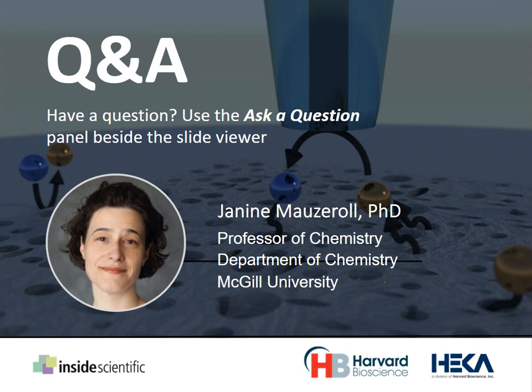Excellent. Thanks, Janine. Next question here, how can I measure the behavior of lithium batteries, specifically electrochemical reactions using SECM? So yeah, you can, for example, use the second story that I told was related to monitoring the intercalation reaction, but you can also use SECM to measure the porosity of the anode and evaluate how much the mass transport is limiting in the cathode.